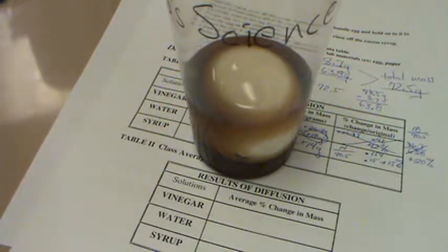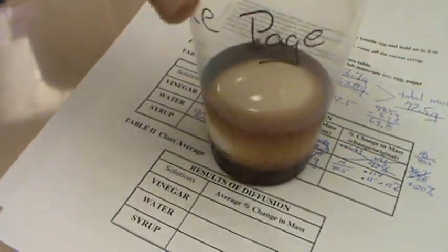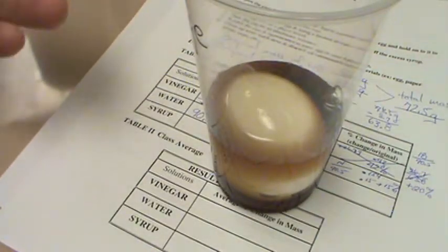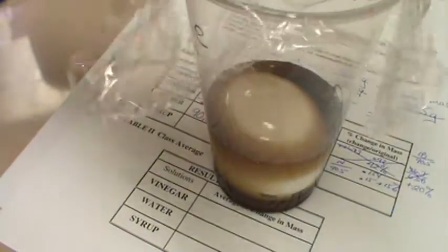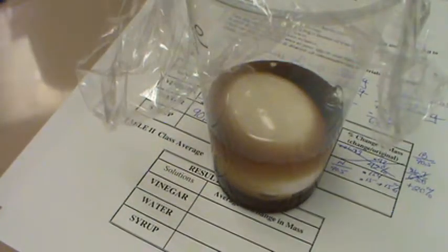So, will it? Maybe the sugars will be drawn in to where the water is. Some students might think that. We will see. But spoiler alert, the plan is that the syrup will draw water molecules out, and that at the end of this experiment, this egg will have less mass than it does right now.